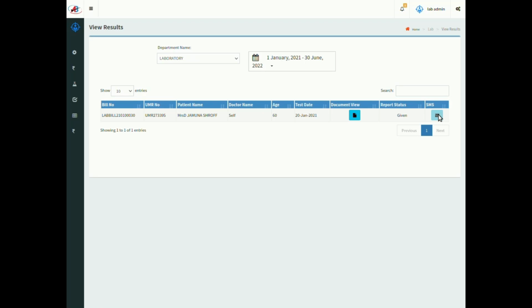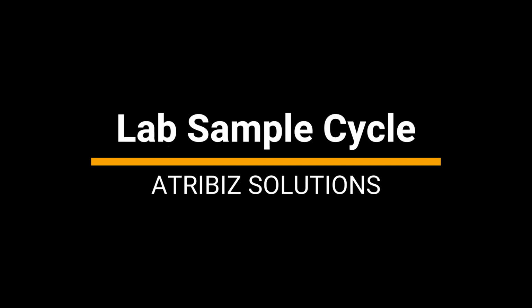This is about the sample cycle submodule of laboratory module, developed by Atribiz Solutions.